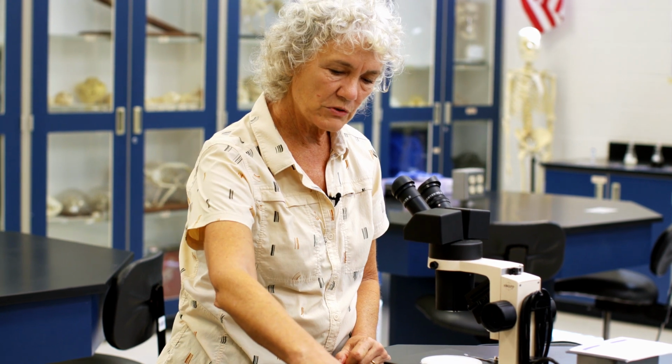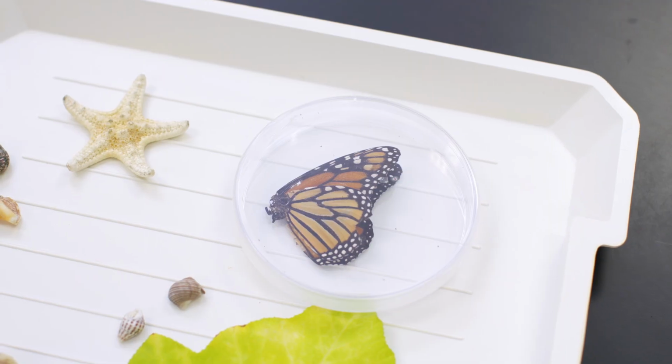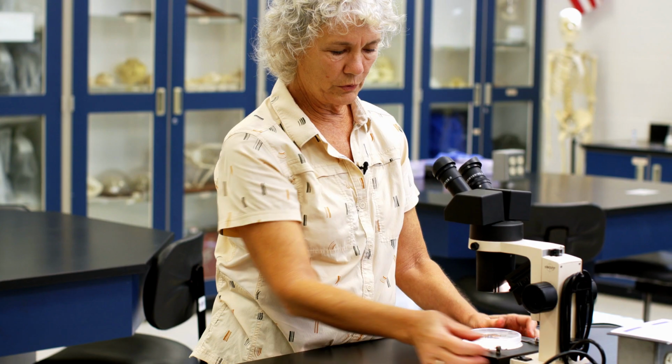Some things are pretty interesting under the microscope that you might not expect. For example, the butterfly, it has little tiny scales on here, and looking at it with both the top and the bottom, you can see the light reflecting on those scales. Even though it's opaque, it still helps to have both lights on. So in this scope, you have a lot of different choices of things that you can do. You just don't see things quite as close, but you really don't have to for some items.